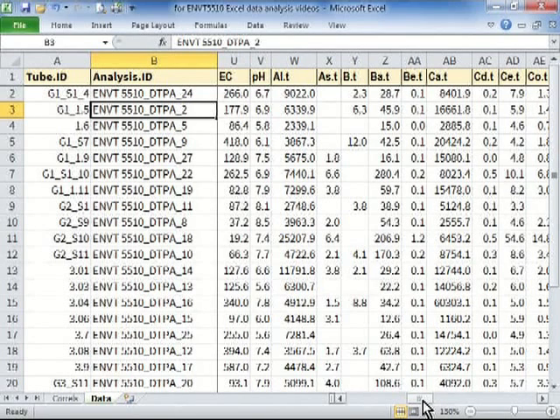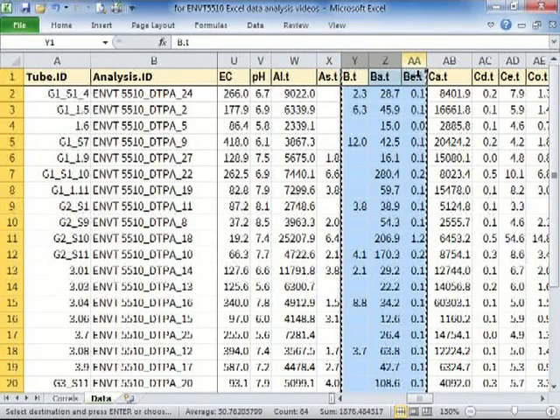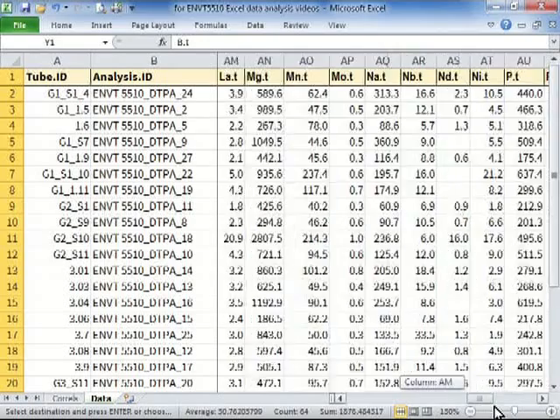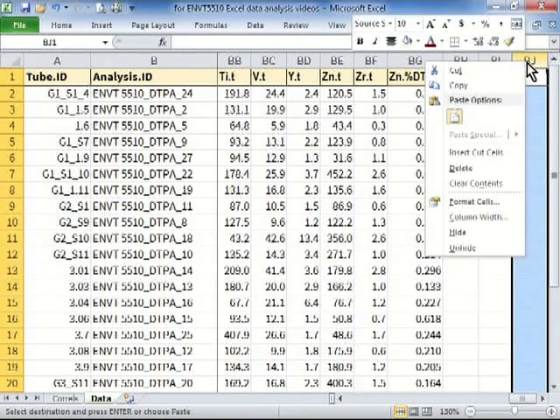This is where we don't look for relationships, we look for the ability to predict things. Now, what I'm going to do here is to create a different list. I'm going to get rid of a bunch of minor elements and relegate them to the back row, so to speak.